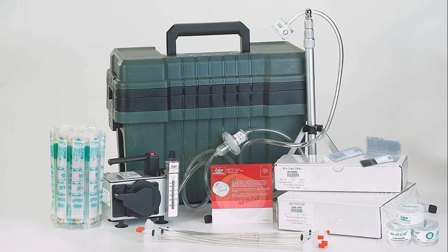It's also available as an ultimate kit with 50 aerosol cassettes, 50 biotape slides, 50 mold swabs, and 10 inner wall attachments.